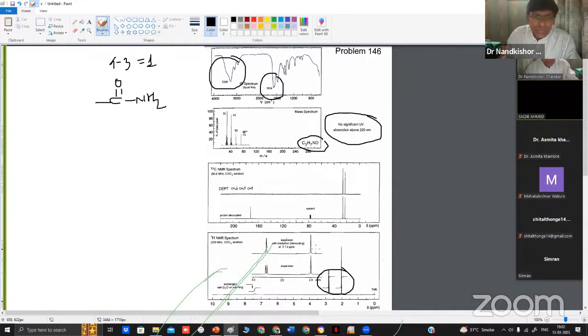Now these two CH3 groups are possibly present here, this one and this another one. So that we can mention over here. There is a presence of this NH, it may be the NH or NH2 group. Again, there is no doublet mentioned over here. If there is no doublet mentioned over there, that indicates what? There may be presence of NH. So this probably may be the NH, but there is an amide group present, because why? The carbonyl stretching frequency is 1654.